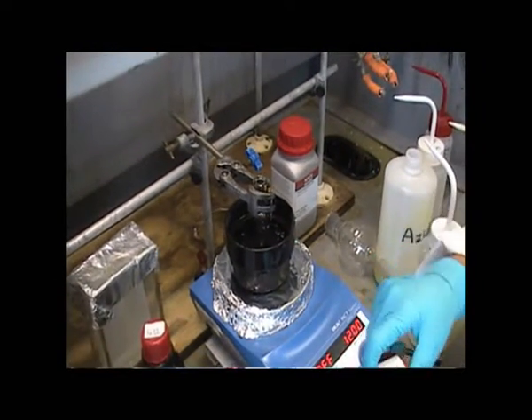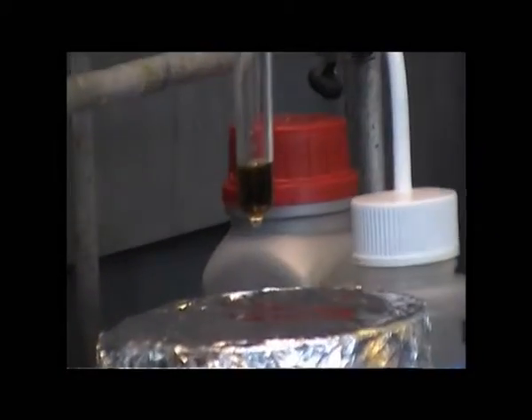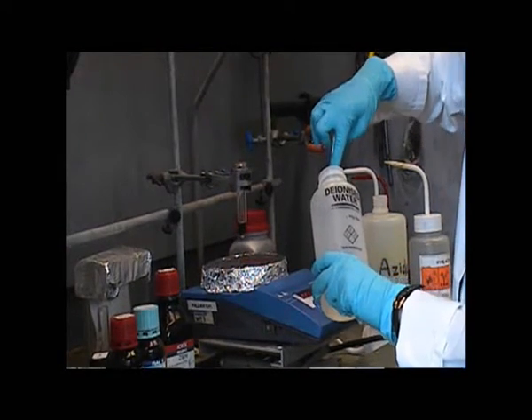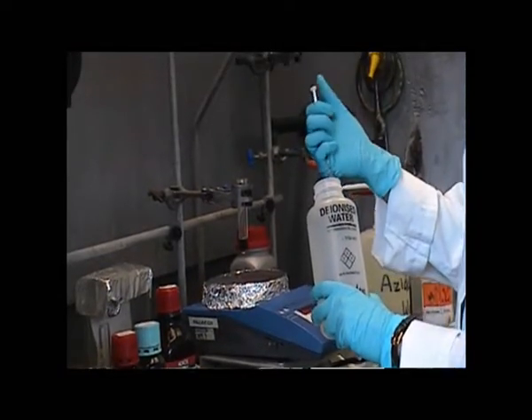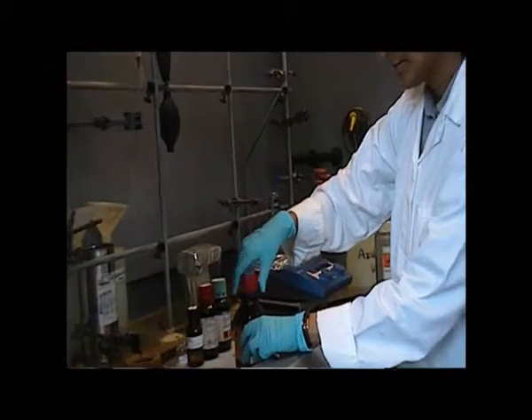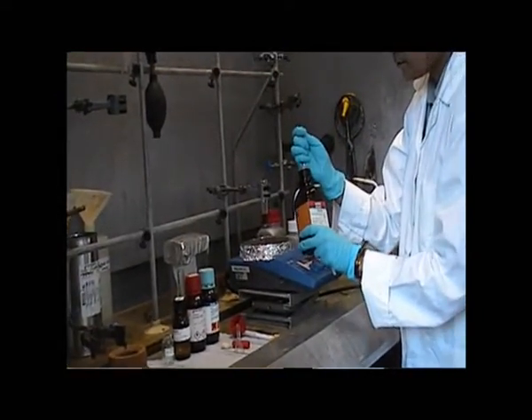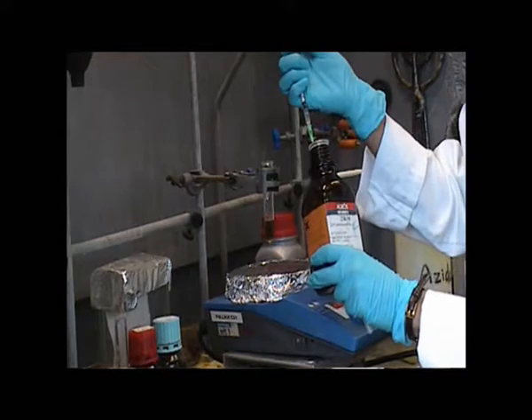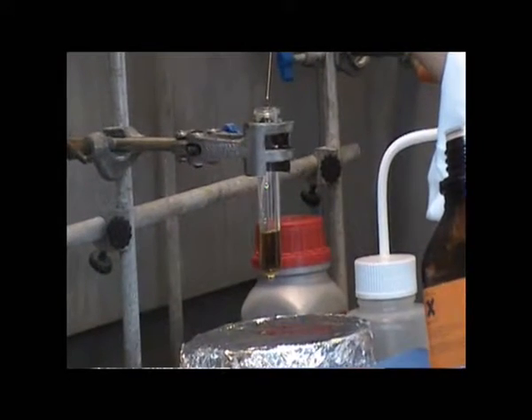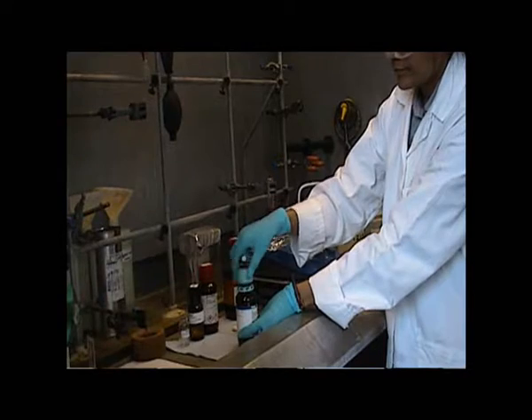The ice bath is then removed and the reaction stirred for 5 minutes at room temperature. One milliliter of deionized water is now added. This is followed by 130 microliters of 2,6-lutidine, and 128 microliters of thiobenzoic acid.